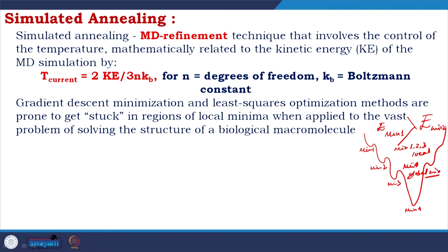Simulated annealing is the process where you have to overcome those local minimas. Simulated annealing is mostly like our moms, our mothers. You are in class 10, you give an exam for the board, you get a certificate, happy. Your mom will say, what will you do in life? Go ahead.